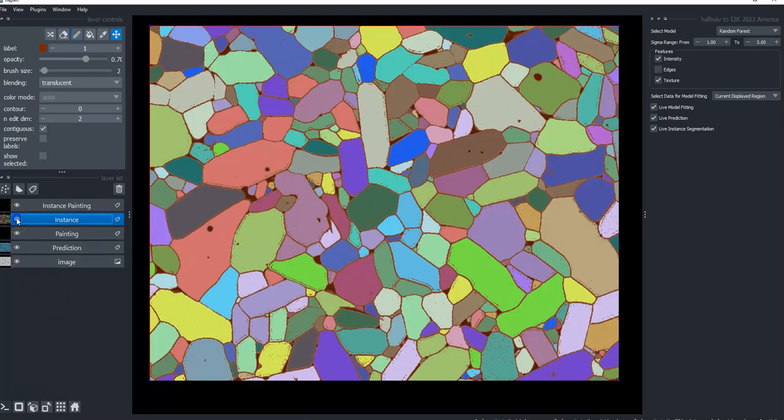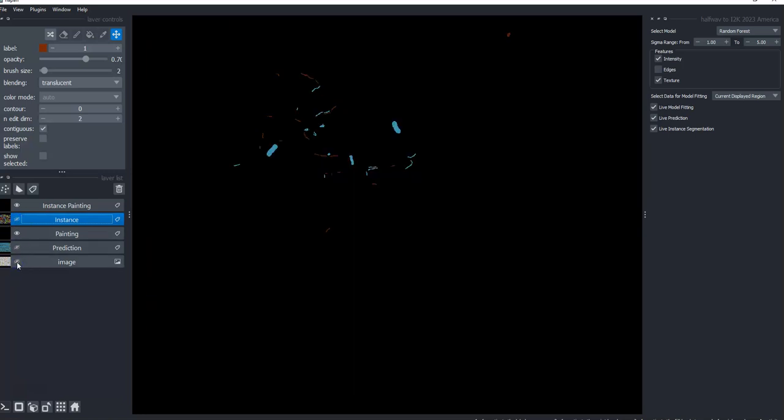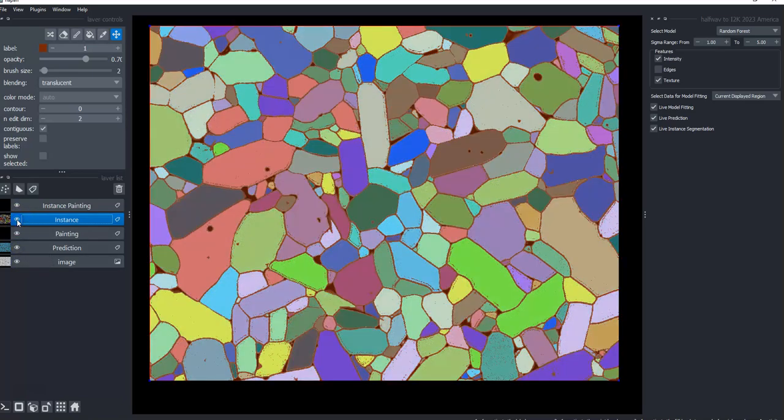So yeah, after some labeling, here are the labels. You get this segmentation in these instances, and some of them look like they're merged, but when you hover over, you can see that unfortunately it sometimes colors them the same, even if they're beside each other. So you sometimes have to hover over to see if the pixels are different. So yeah, this isn't too bad. That being said, again, fair fight, the classical image processing did just fine on this image too. Okay, so that's the first example.